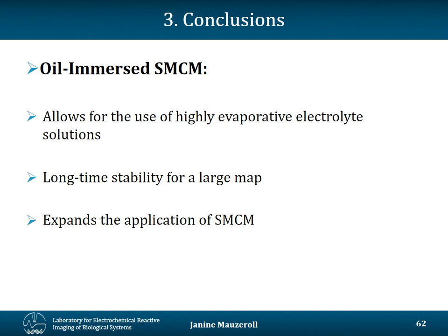But because of the oil, we can avoid this. And it allows for really long time stability maps. And so we really like this new application. And if you're interested in corrosion and you need to scan large areas, it's a really viable option.